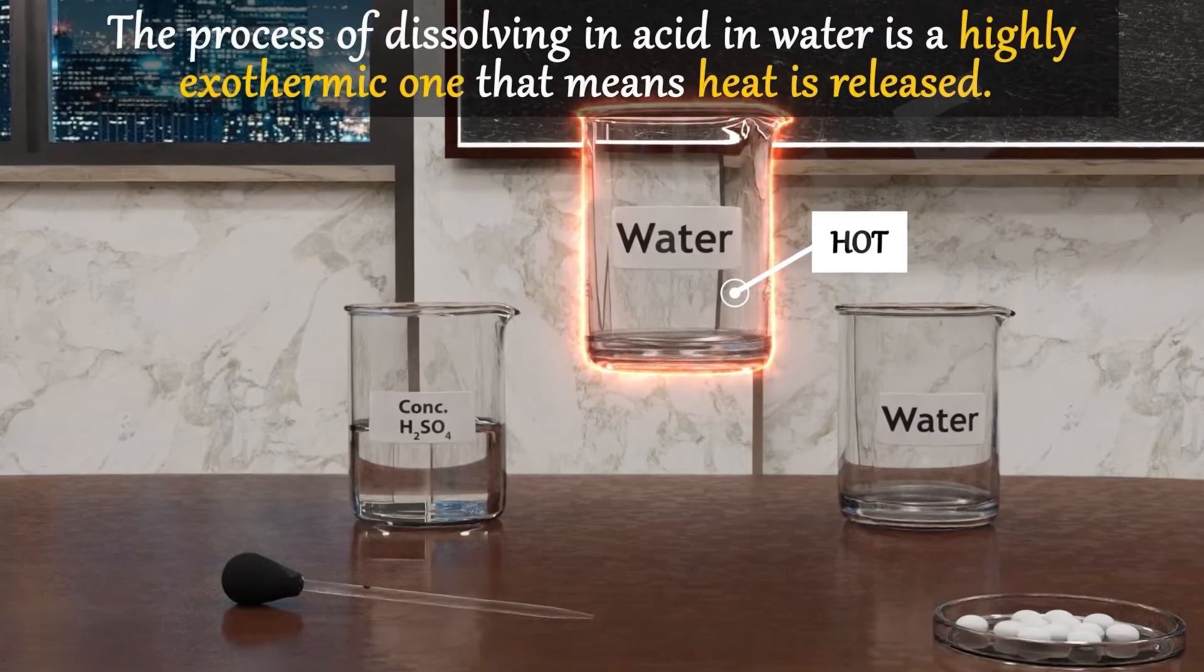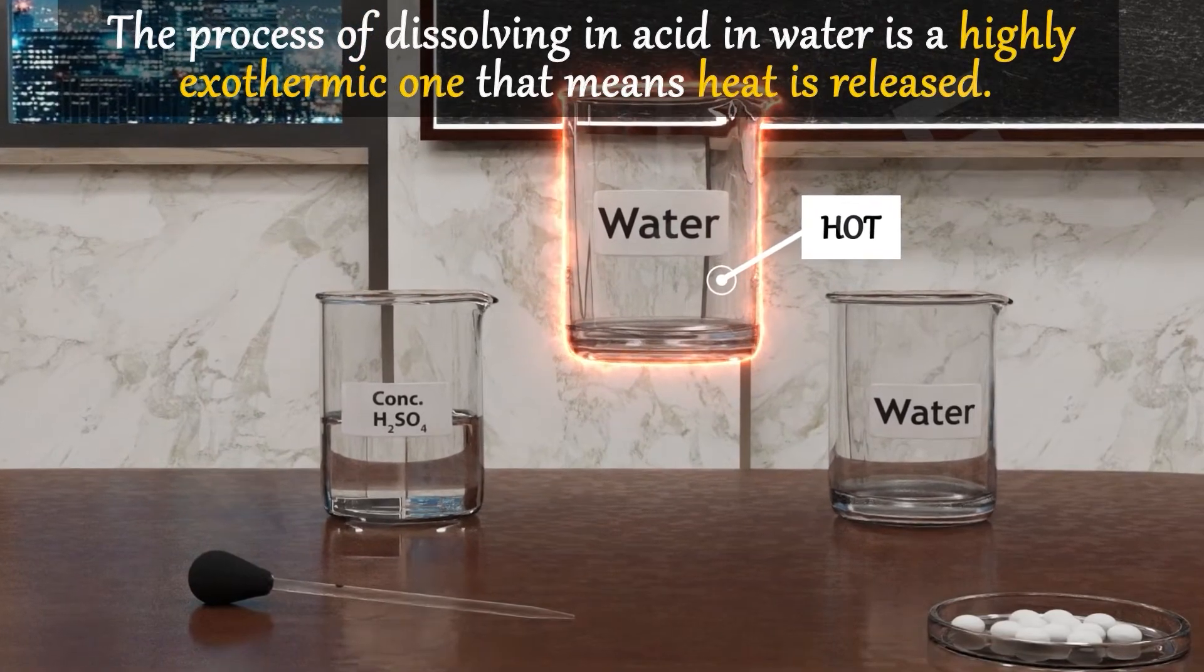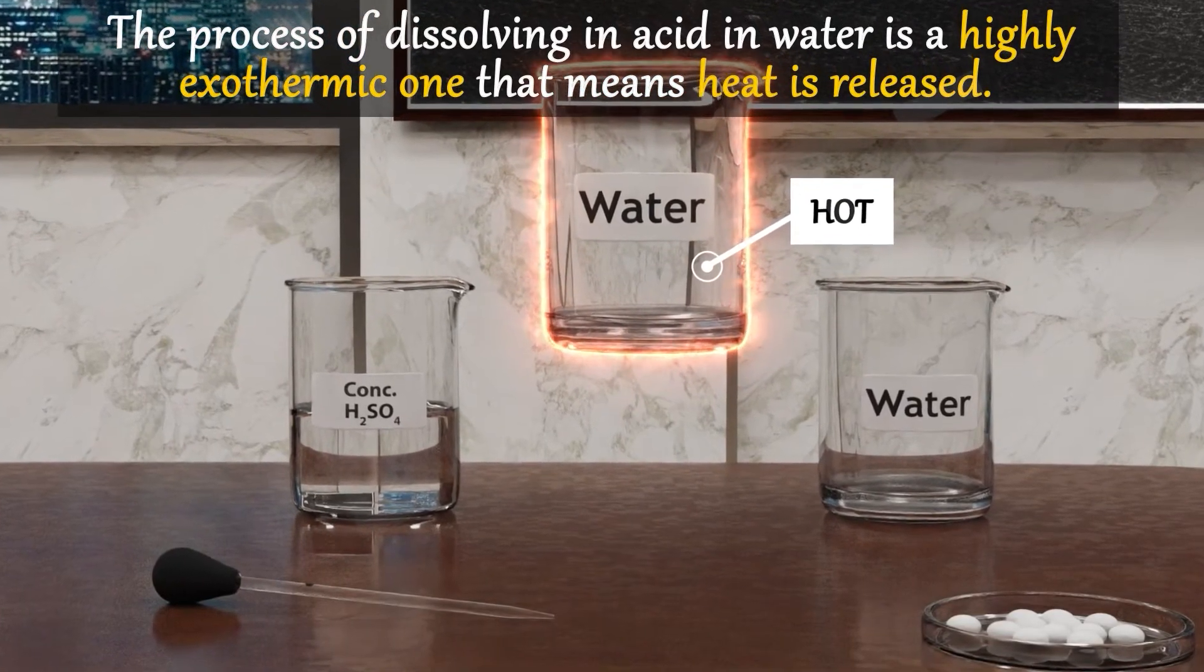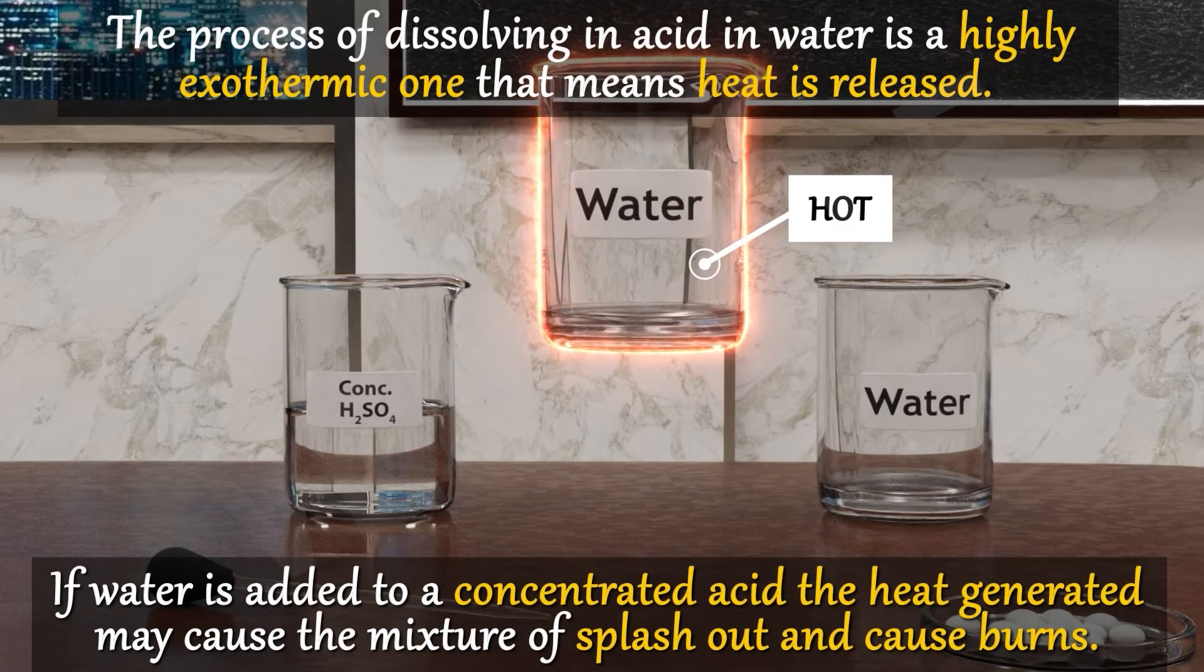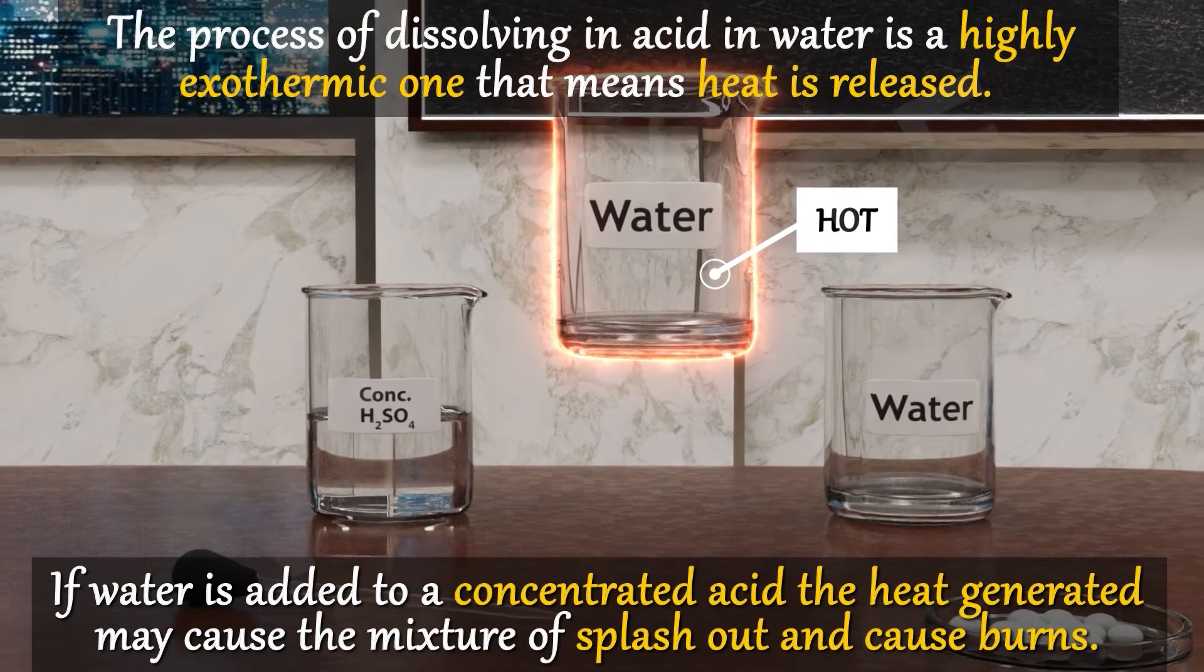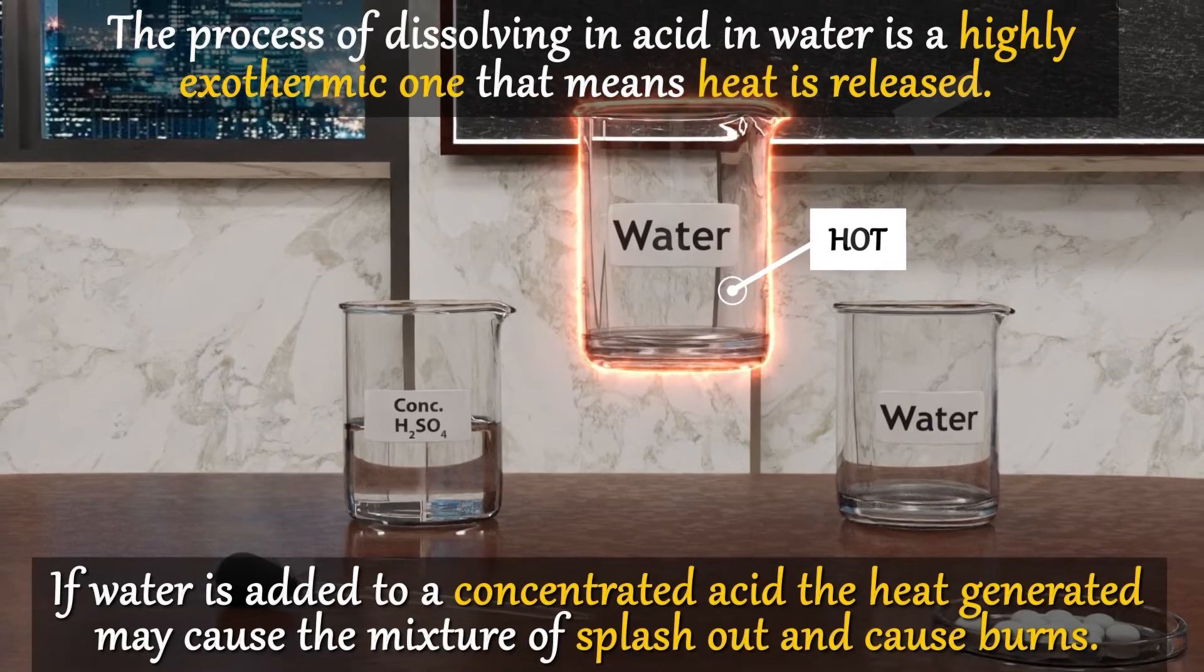The process of dissolving an acid in water is a highly exothermic one, that means heat is released. If water is added to a concentrated acid, the heat generated may cause the mixture to splash out and cause burns.